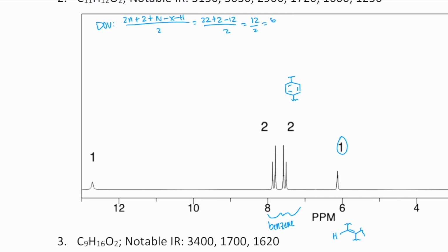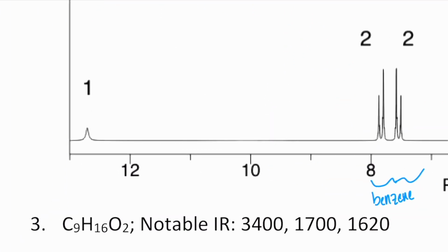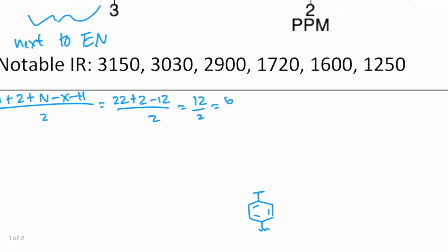All right, how about, what's at 12? What's above 12? Well, the only thing that's really that high is either an aldehyde or a carboxylic acid. And carboxylic acids tend to be a lot higher, whereas the aldehydes are near like 9, 10-ish. So here we likely have some carboxylic acid. Okay, we can also take a quick tangent and look at the IR, right? Because we are given it, so might as well use it.